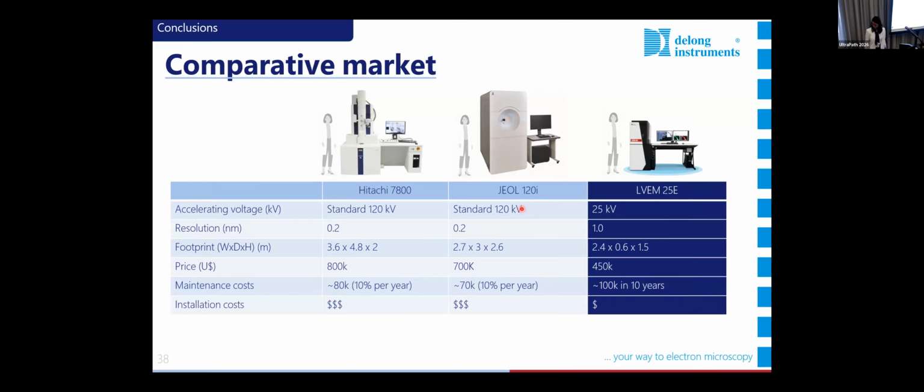And the standard power supply, just a standard grid, everything. Yeah, it's exactly like a standard TEM. The only difference is the low voltage, and because we can do 25 kV, that's why we can make everything compact. It's a different design, but it works exactly like a standard TEM.